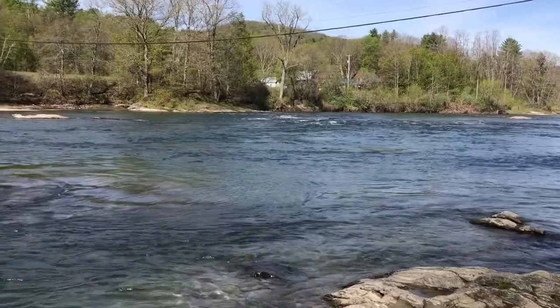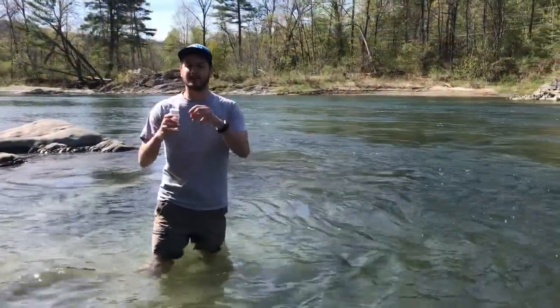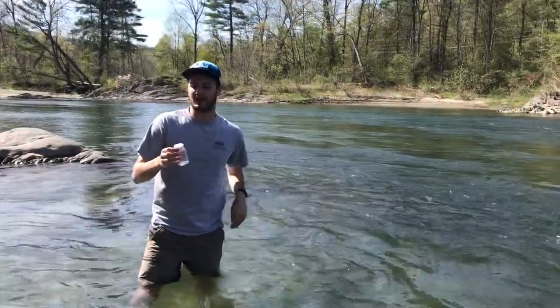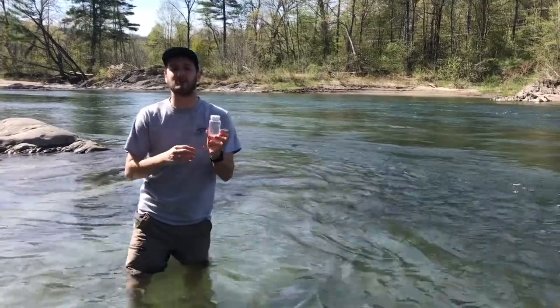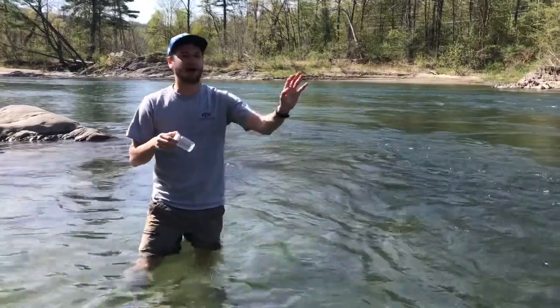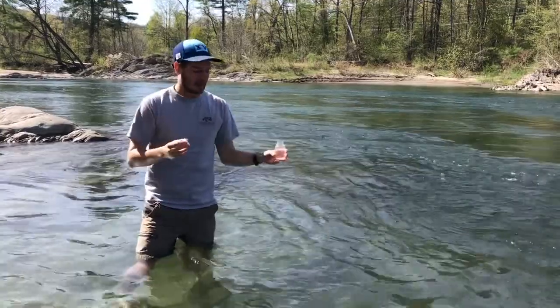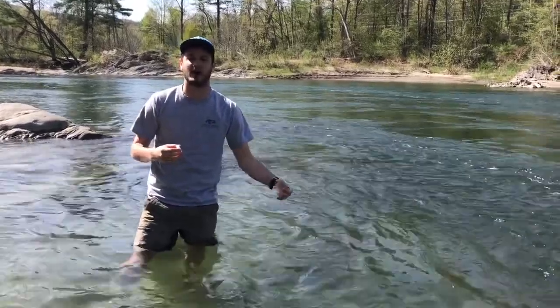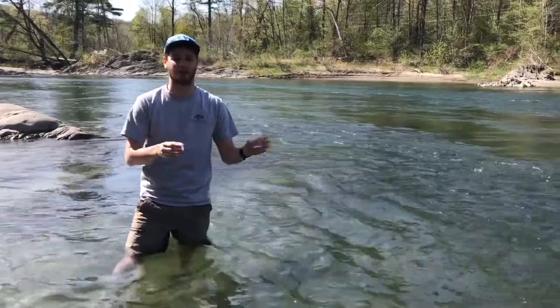I'm going to enter the water to take a sample. Once I'm positioned in the water, I'm going to take the seal off my bottle. You want to make sure that you sample as quickly as possible once the seal is off, because we don't want to contaminate the bottle. I'm going to position my body facing upstream, take the top off the bottle, and sample at least eight inches under the surface of the water. If the water is shallow, make sure you're halfway between the bottom and the top of the water.